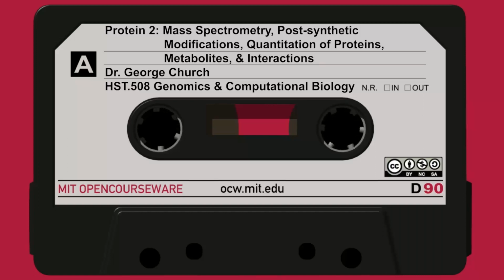So in a way, this is a way of going directly, due to this observation and somewhat logical expectation. Okay, so now we have all sorts of separation methods and motivation for studying them more than just using them. But now we want to look at a particular case of separation. We're talking about complexes and protein localization.